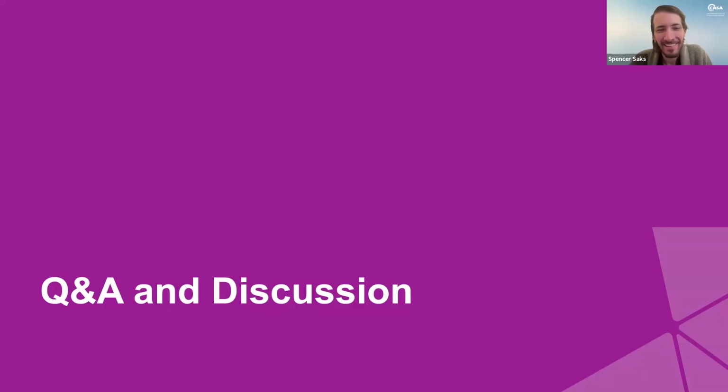And then the next question I see is for new operators and utilities, what are some common errors that cause issues more frequently? Maybe you guys can talk about some common errors we encountered in terms of the COC form or during the shipping and the transition.